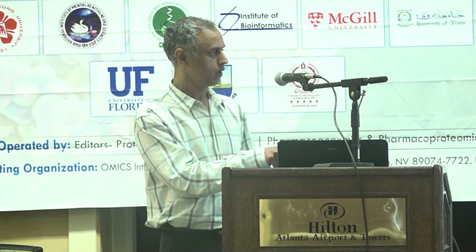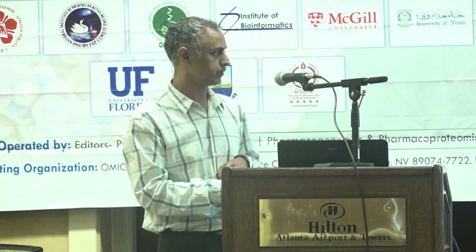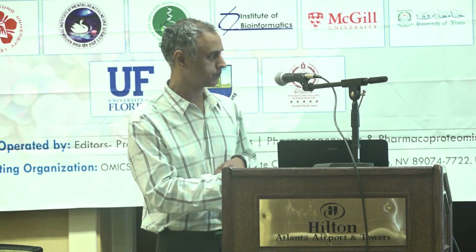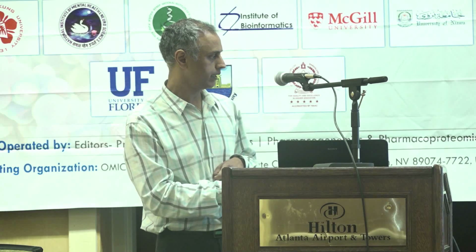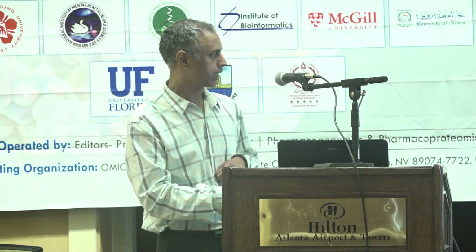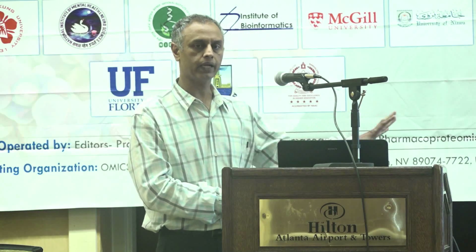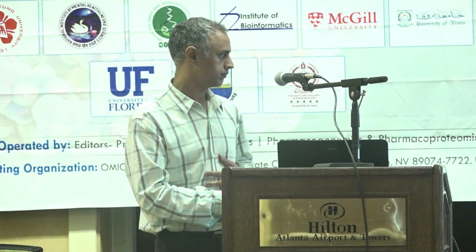And when we did, these are results from our whole genome sequencing. And here, what we can see is clearly that KatG gene has a deletion. And that deletion we can easily pick up in this strain. This one here, 42, we have a deletion there, and that deletion actually truncates this gene into a very small protein product, and that is what is causing it to become resistant to INH.